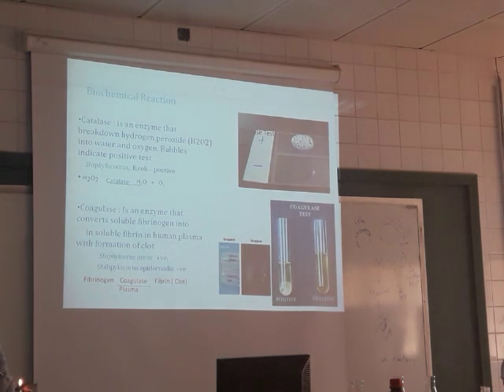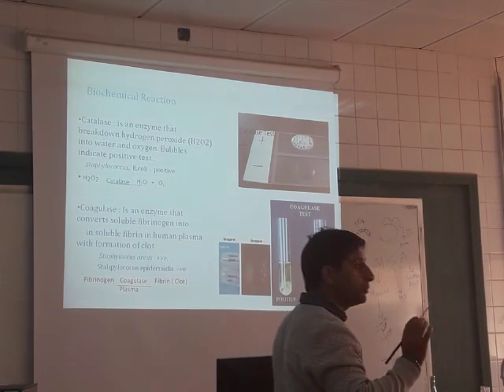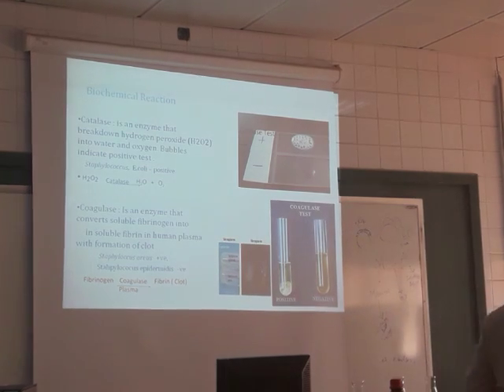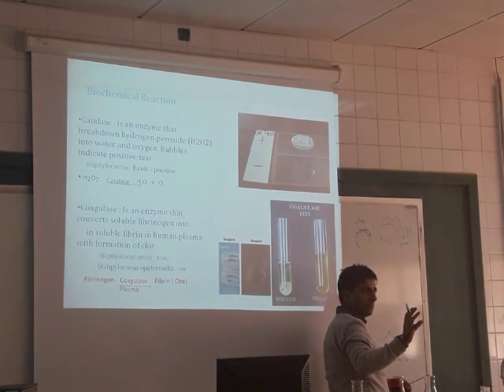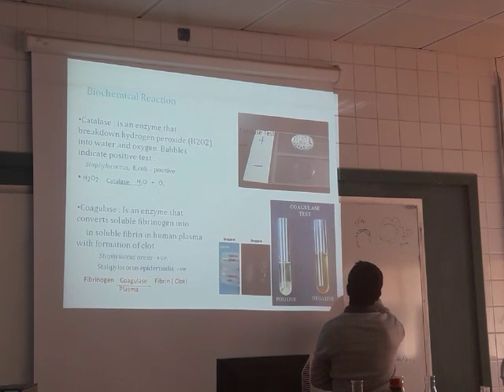If bacteria have the enzyme catalase inside the bacterial cell, it will break down hydrogen peroxide into water and oxygen. Catalase is an enzyme present not in all bacteria, only some bacteria. That is the property of catalase. What is H2O2? Hydrogen peroxide.